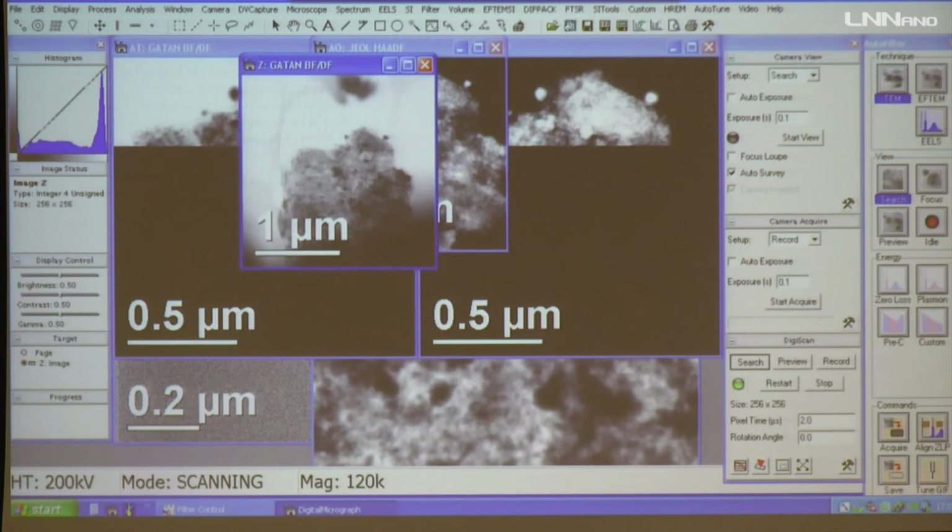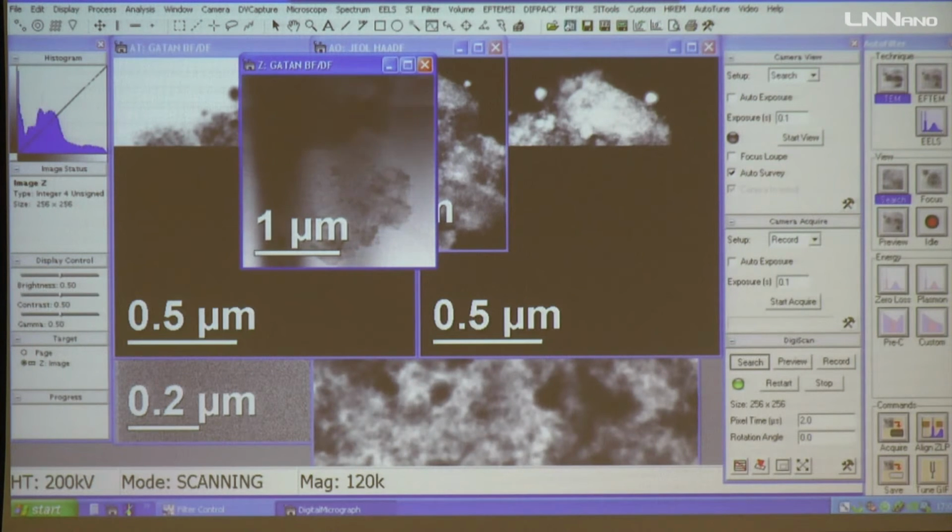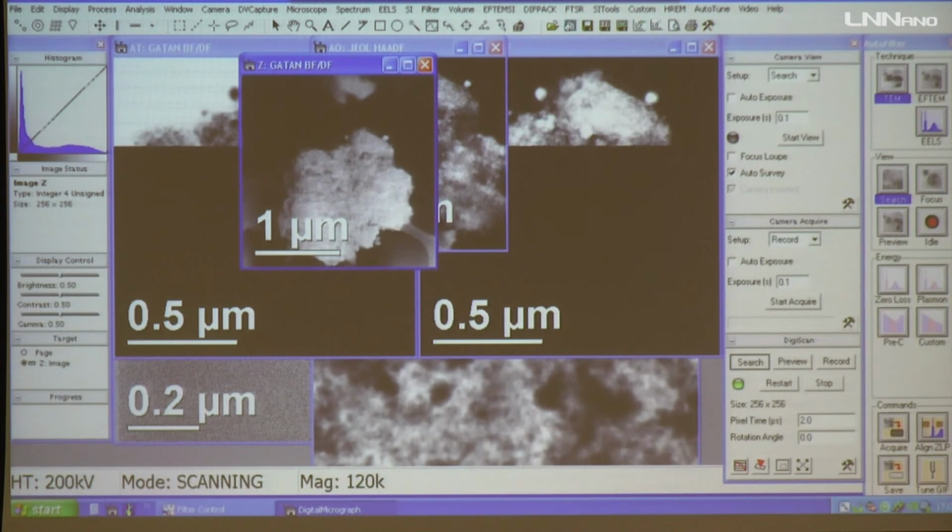Let's try another way to see. Here I have everything. See, here I have something interesting, okay? It's completely out of the correct operation, and there are some directions that work better than others.